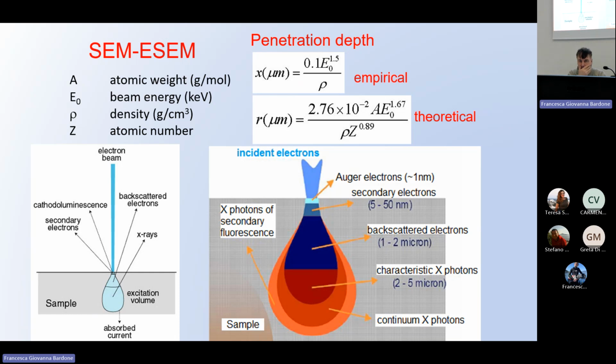Okay, we can continue. So, as I said before, this was the last slide. And remember, the resolution in the scanning using the secondary electron must not be confused with the analytical resolution.